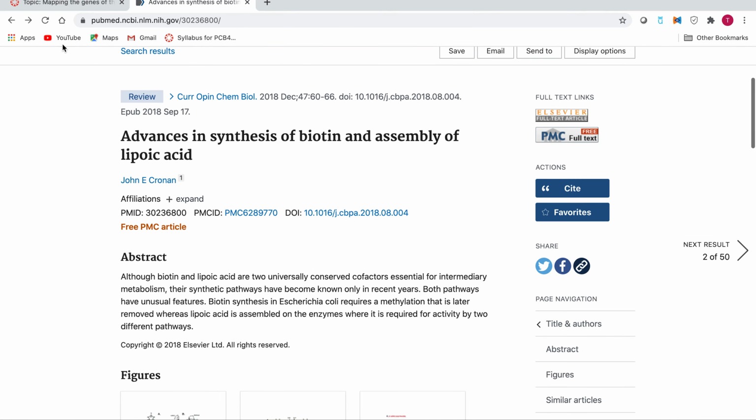here. And this is cool because it'll actually link to KEGG here. You can click on this, and then you can go to all the different genes here and the enzymes. We can click on this one, and you can see this is BioF. Let's see if we can find BioB. This would be BioB. It'll give you all that information, including the pathways it's in. So this is a better way, I think, because it gives you that pathway, and then it'll give you the sequence data as well.